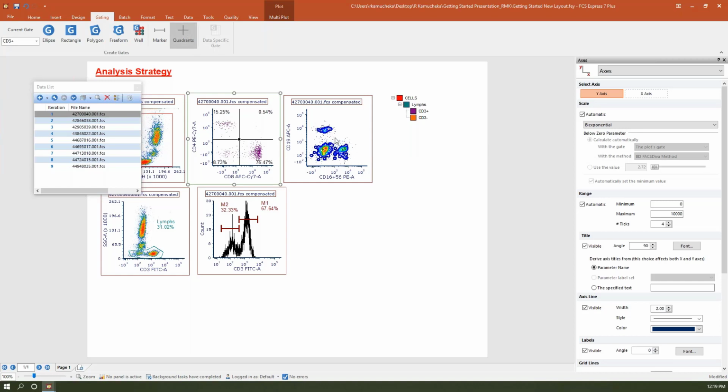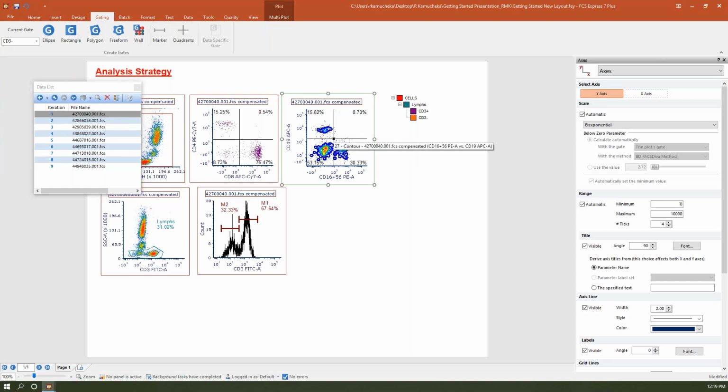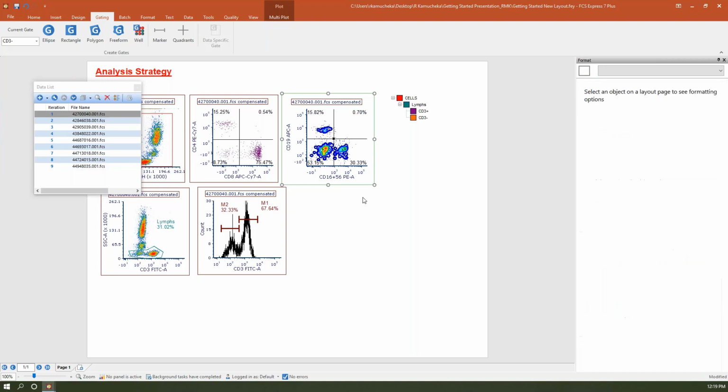I'm going to add another quadrant here. Quadrants, like markers, are also not automatically gates. Again, this is just kind of useful in case you're doing immunophenotyping and I'm drilling down and not sure what wants to be what, but I'm pretty sure that I didn't want to create 8 extra gates getting there. So this, again, just gives you that feature to really define how you want to gate and what you want to create as a gate.